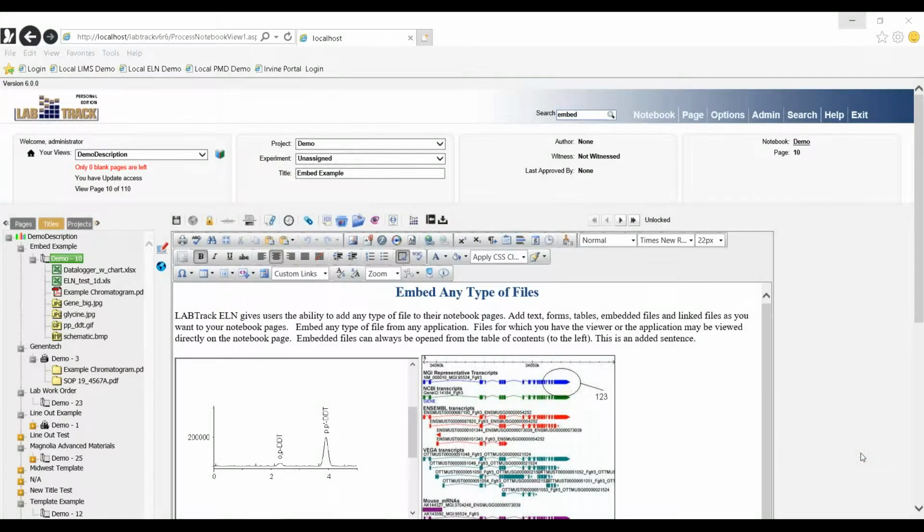And then they can browse to and log into the Electronic Lab Notebook software. And this is the user interface that the user would typically see. Now, I've logged in as this user named administrator. And by virtue of that, it lists for me all of the notebooks that I've created or are available to me to read or edit. There's various levels of permissions that can be set for the users and groups of users. We'll get into that in a little more detail in our full-blown demonstrations.